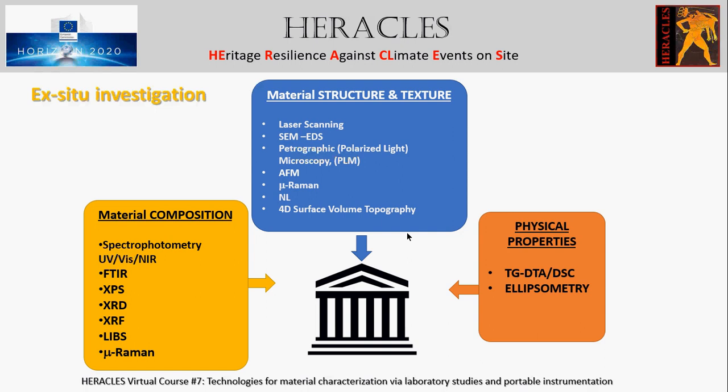X-ray diffraction is one of the most useful ex situ characterization techniques, and together with X-ray fluorescence is considered a basic analysis tool for the characterization of materials. Although XRD is not a destructive technique in itself, it also requires sampling.